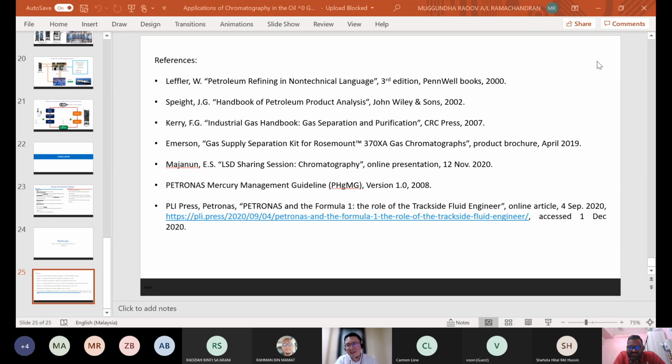But most of the time the laboratories or testing facilities are located on the platform, and most of the analytical setups we have at the platform are not as complicated as the ones we have at the laboratory. That's why we don't have a full benchtop GC. We use a micro GC, a portable GC. Everything is compact, so it's easier to bring around, and less prone or less sensitive compared to a larger system. So these are some of the tricks and ways that we handle these kinds of situations.